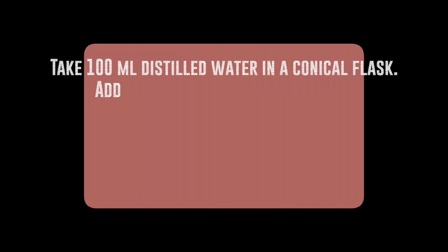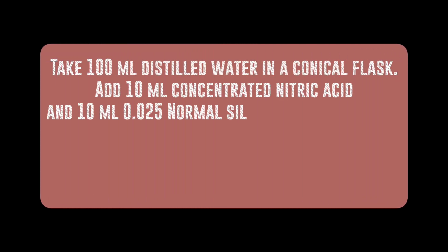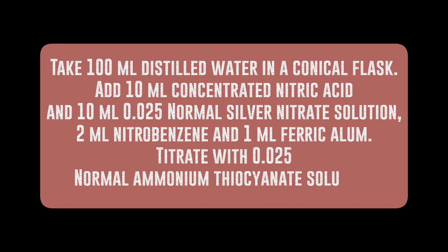For the blank titration, take 100 milliliters distilled water in a conical flask. Add 10 milliliters concentrated nitric acid and 10 milliliters 0.025 normal silver nitrate solution, 2 milliliters nitrobenzene, and 1 milliliter ferric alum. Titrate with 0.025 normal ammonium thiocyanate solution.